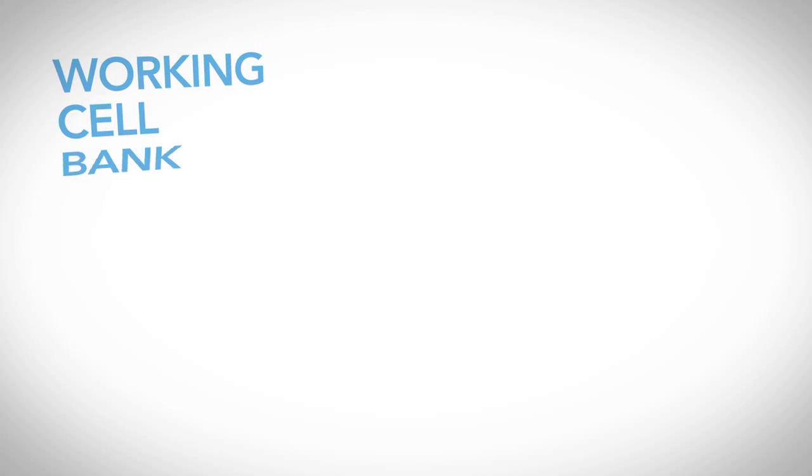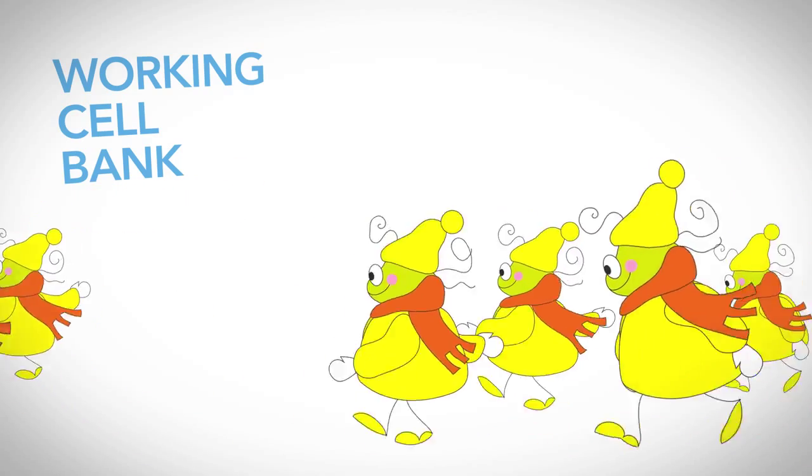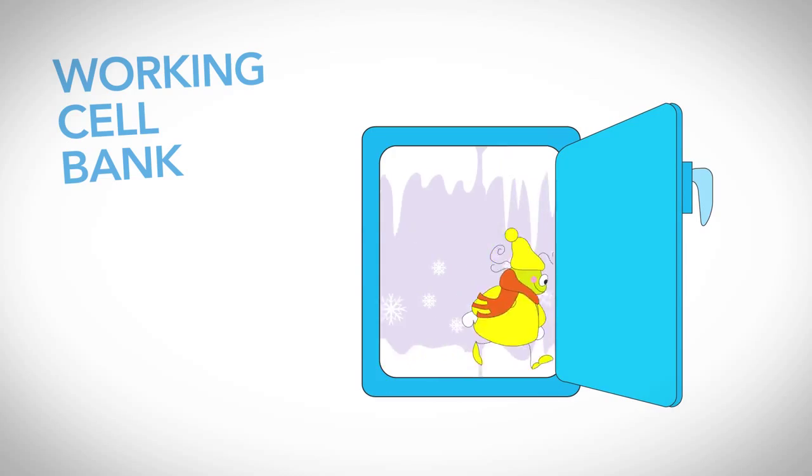Working cell bank. A homogeneous suspension of these bacterial cells, the working cell bank, has been prepared and subdivided into vials stored frozen at below -70 degrees centigrade.